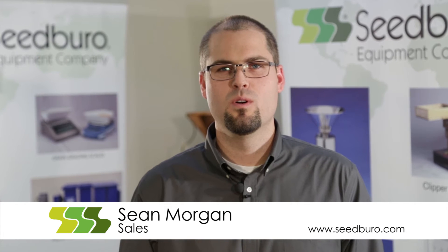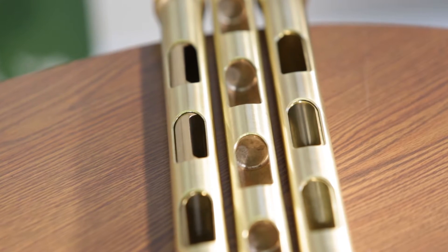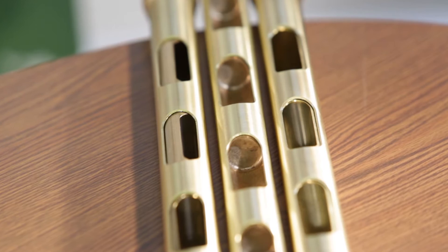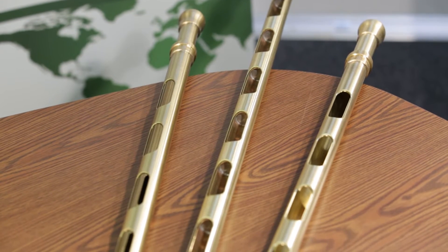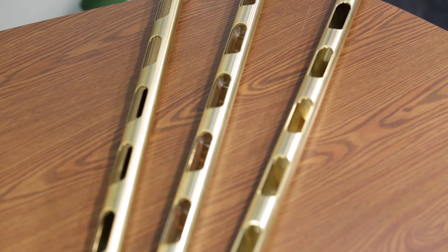Hello, my name is Sean at Seedburo Equipment Company, and today I wanted to explain sampling probes. Seedburo has many different sizes and styles of sampling probes to fit different functions. Some of our different styles of grain probes are open-handled probes, partition probes, and spiral probes.